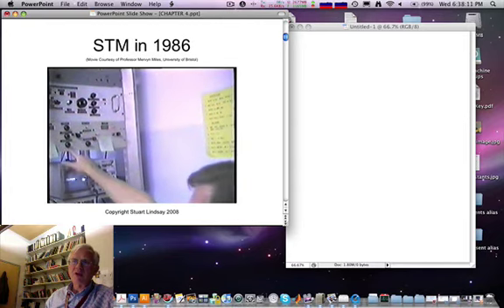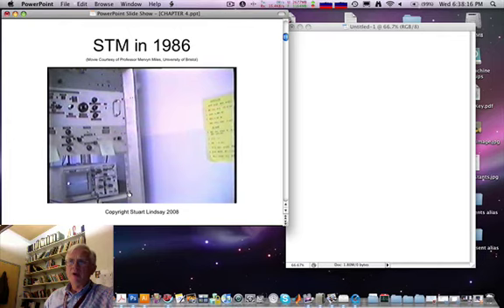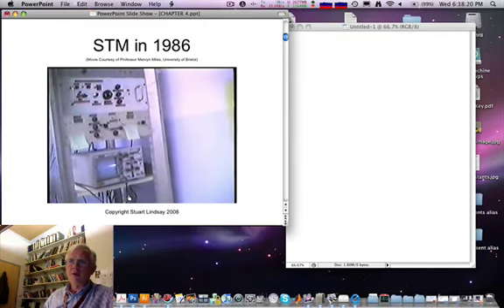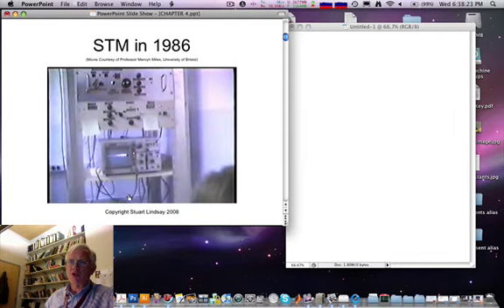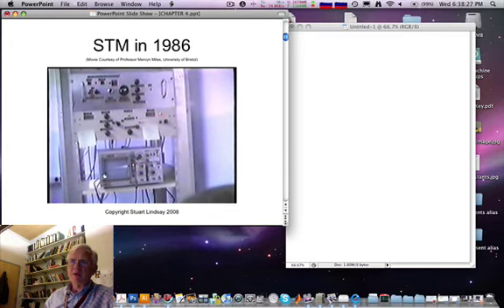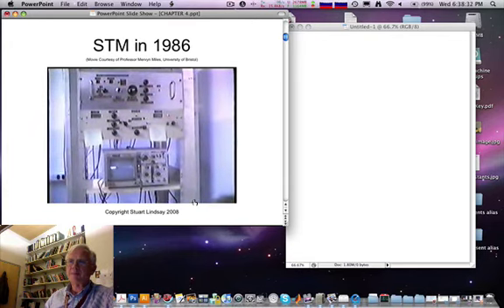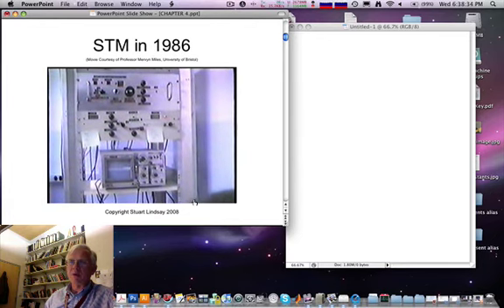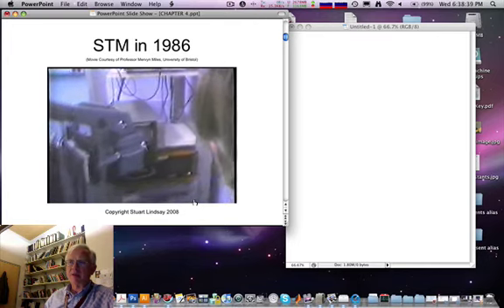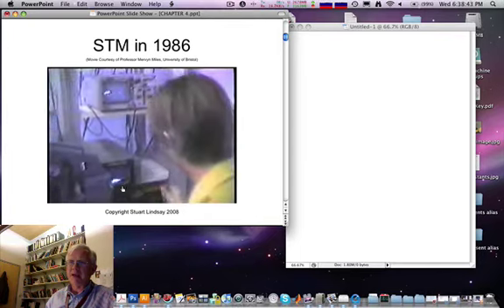The tunnel current is shown on this screen here, and down below you will see the controller that moves that piezoelectric motor to push the sample up towards the probe in small steps. So right now no current is being detected. The probe is being advanced towards the surface, and the microscope's being asked to stop the advance when a tunnel current is detected, which it was there.